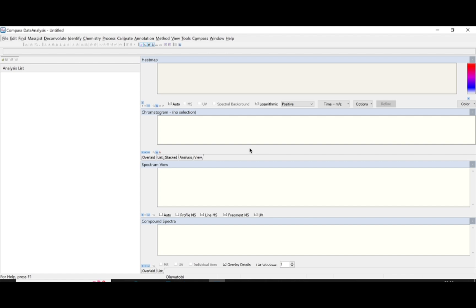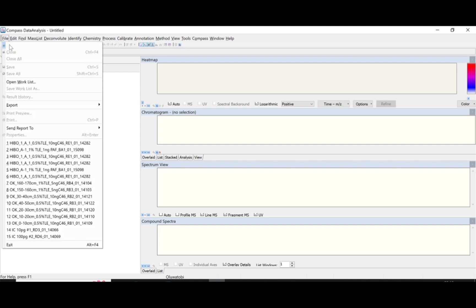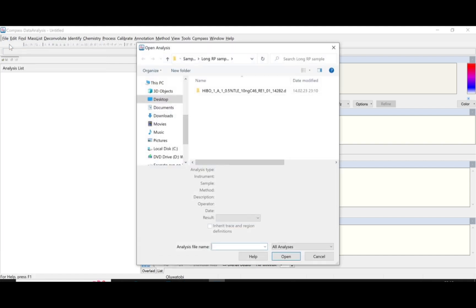On my screen is the Compass Data Analysis Software, which has been already opened to save us time. The first thing to do is to load in your data. To load in your data, you click on File, click on Open — the same way you open your files in Microsoft Office.